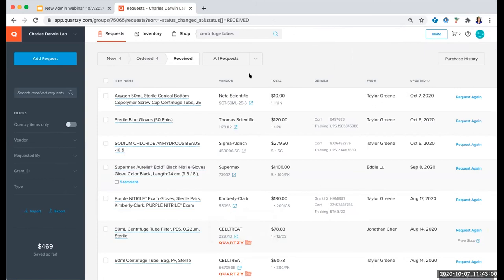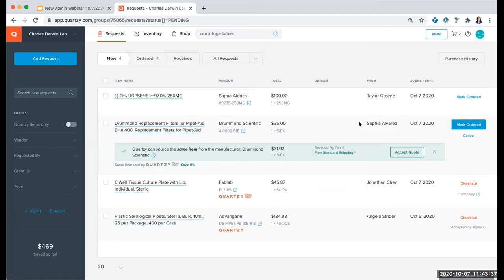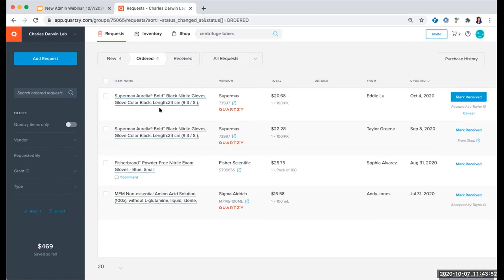A question came in: user versus admin — does the view change what you can see, or just what can be approved and moved? Is anything hidden from a normal user? It changes slightly but not very much — the overall page layout will be pretty much exactly the same. What changes will be some of the action buttons. Members in a lab cannot click Mark Ordered, nor can they check out — what they would see is just a submitted or ordered status without those action steps. For example, if a requester like Sophia is just a member in this lab, they could only edit the request before it gets ordered. Once that item goes into the Ordered status, members have limited editing privileges.